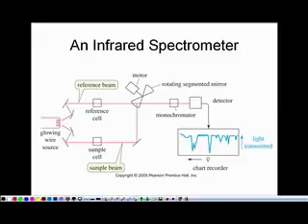Now, the spectrum for an infrared is upside down. The peaks are pointing down. This is our baseline, the zero absorption, and then the peaks point down. That's how it's been done traditionally. Every textbook shows those peaks upside down, so I'm going to continue doing that. With the computerized instrument, we can now flip everything right side up, but nobody does. It's always still upside down.